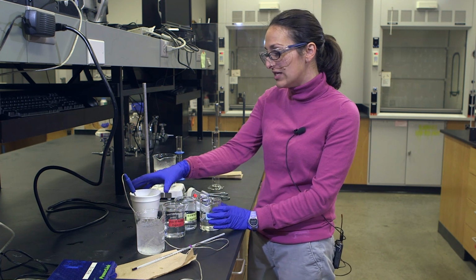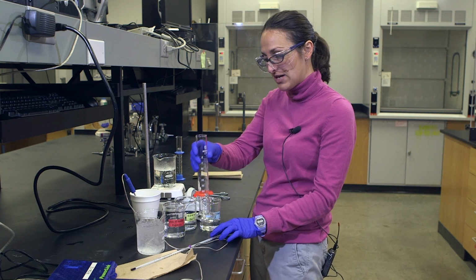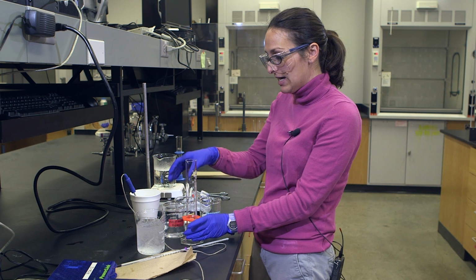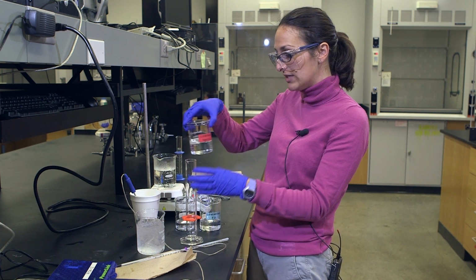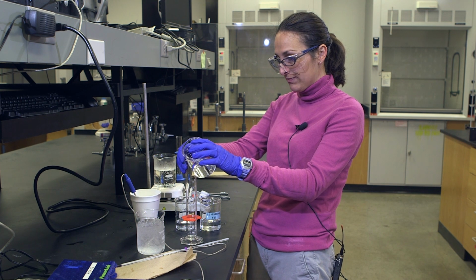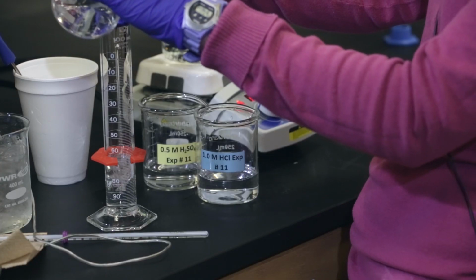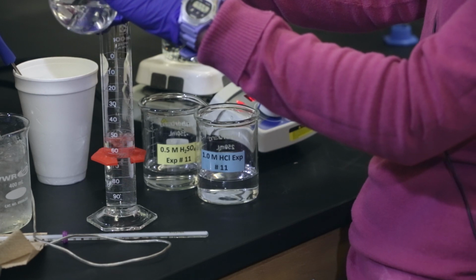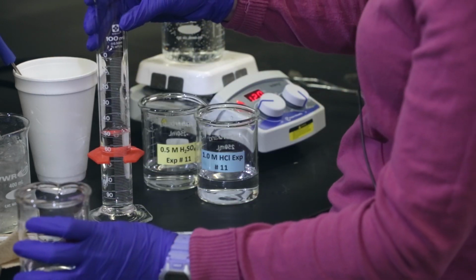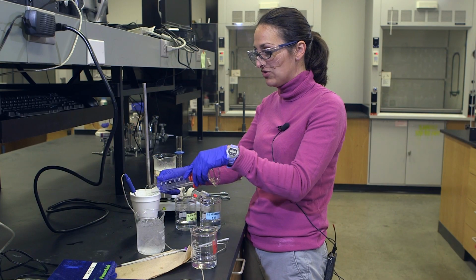Okay, so for this one, I'm going to be really careful. It's really important for this experiment to measure out carefully each of your solutions. So we're going to be measuring the enthalpy of reaction for a couple of mixtures. We're going to measure our amount of sodium hydroxide. We're going to add that to our cup, measure the temperature.